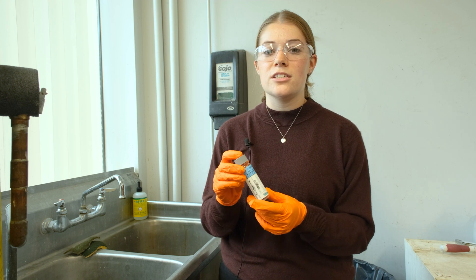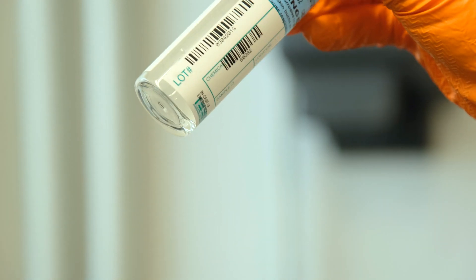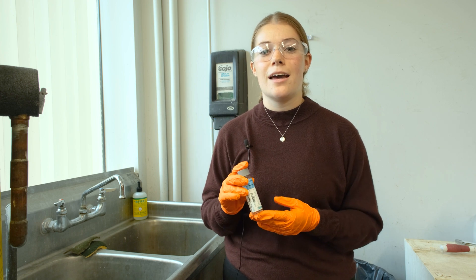One important thing to note is that these vials contain HCl — hydrochloric acid — which is why it's so important to wear your safety gear, including your safety glasses and gloves at all times.